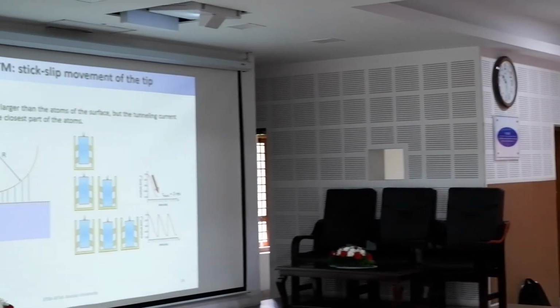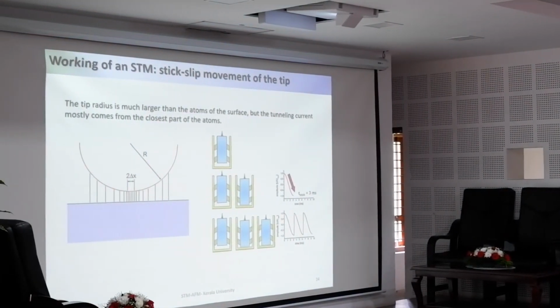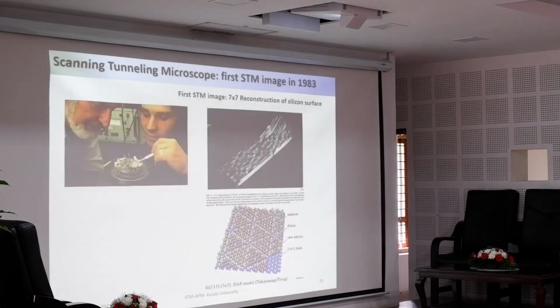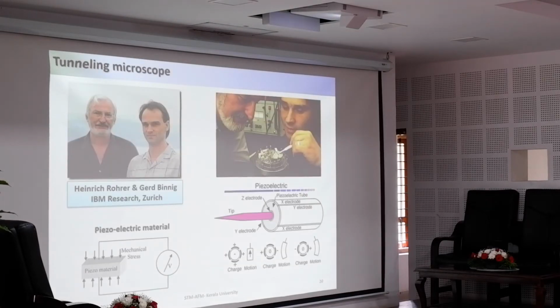It is sticking for some time, then slipping. So this is how it is actually moving. You see, expanding, that means it jumps one step and stops there. Jumps one step, stops there. There will be vibration, but once the tip comes to the tunneling current regime, we call it the tunneling regime, we are not going to move the tip anymore. Now the scanning happens. Scanning will be over an extremely small area, so the vibration will be extremely small. It doesn't matter actually.